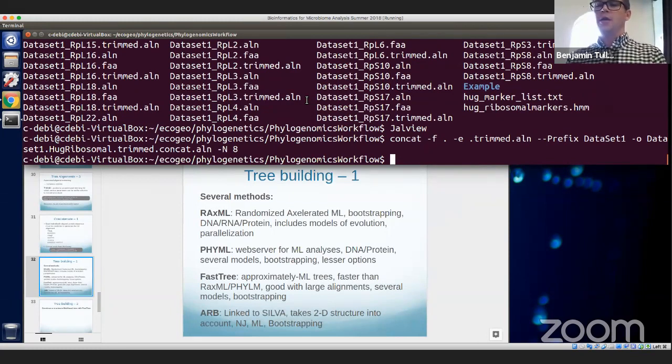As it's running, you can implement similar types of models of evolution and things like that. The thing about FastTree is, and it depends on who you talk to, the FastTree guys and gals think that they have a system that works really well. It approximates a maximum likelihood tree pretty well, in the high 90% range, almost identical in almost all instances. People who spend a lot of time thinking about phylogenetics would say, maybe not.